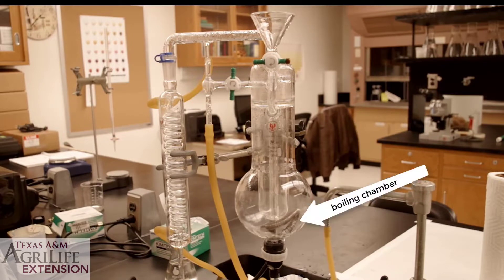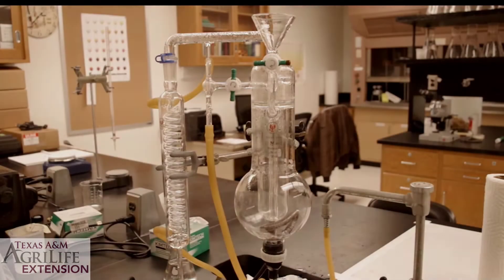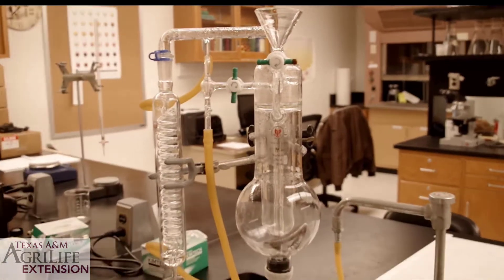On the right we have the boiling chamber. Water needs to go into the boiling chamber in order to heat up the wine sample and volatilize the acetic acid. The wine sample goes into the sample chamber located within the boiling chamber. We have access to both these chambers through the funnel at the top.